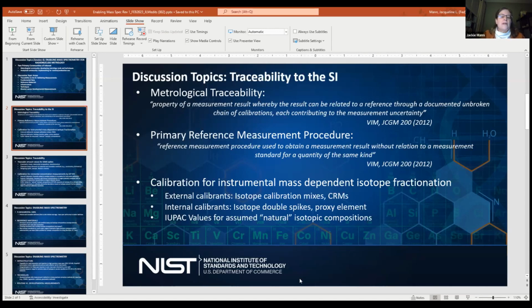I mean, the only time that IUPAC values have been assumed for composition is when it's a situation where there is no isotopic reference material available. So NIST also, back in the 60s and 70s, produced a 900 series, 986, 976. They're like copper isotope standards, strontium isotope standards. A lot of those have run out. So they've moved on to using the 3000 series. Now the 3000 series is not certified for isotopics. The 900 series was.